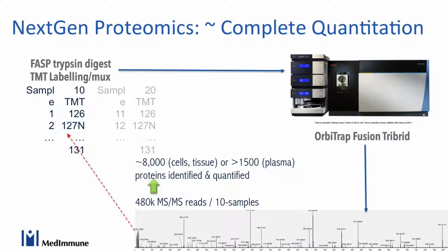The platform that we're going to focus on is proteomics, and it's a little bit different from the Panorama modules that some of you are already using. Here we try to do discovery-type proteomics, where our goal is to quantify as much protein as possible from a given system.